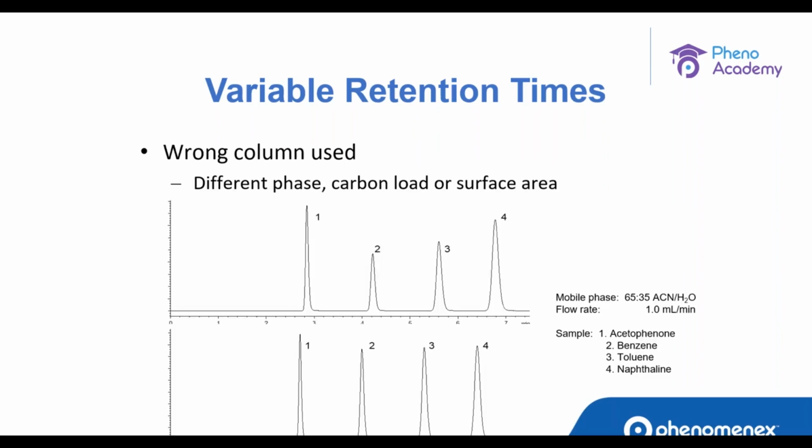Column use. Different phase, carbon load, or surface area will also cause the retention time shift. More carbon load and more surface area will lead to longer retention time. I'm showing the example here.